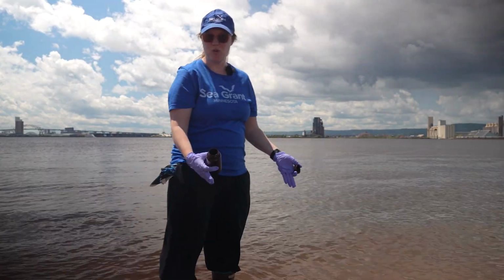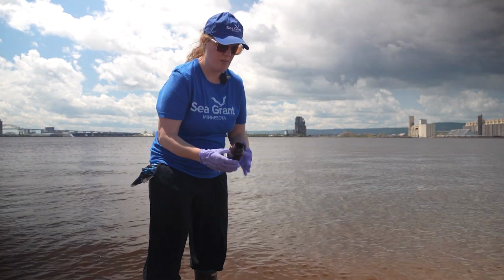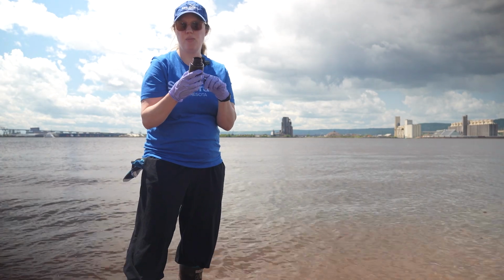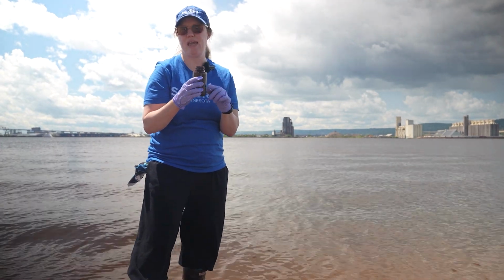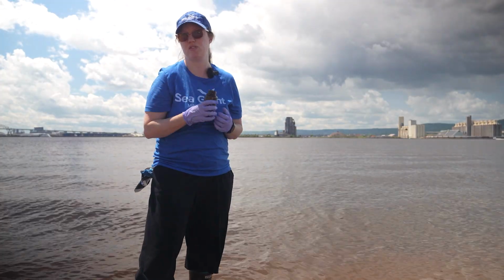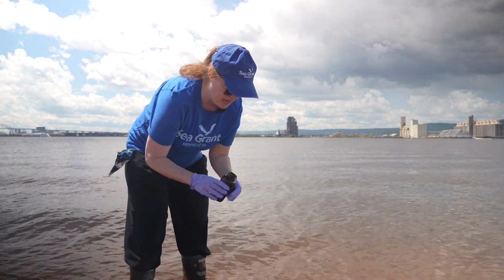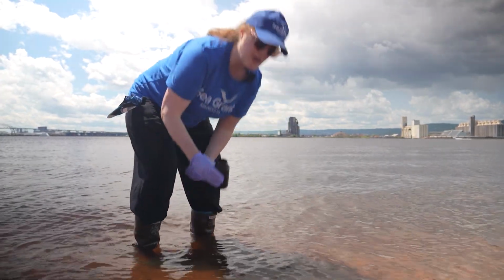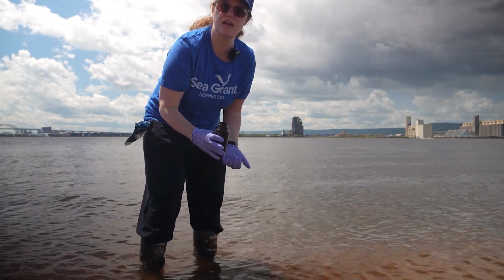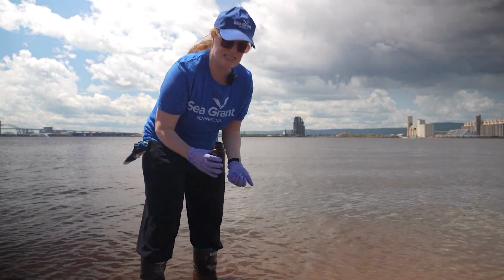Here's our actual bloom where we're going to collect our sample from. And what we're going to do is we're going to only fill the sample bottle up about halfway. And this is going to account for expansion when the sample is frozen. And so we want to get the surface of the bloom, because that's where it's most likely that we would find cyanotoxins.